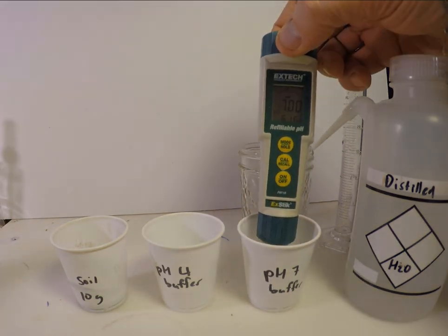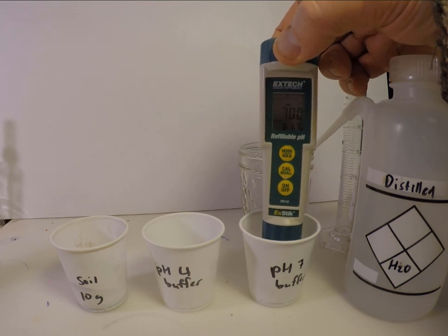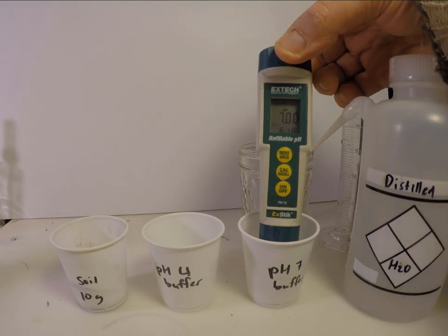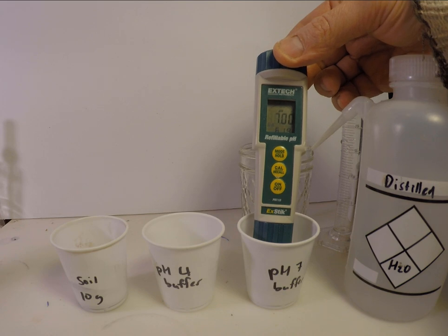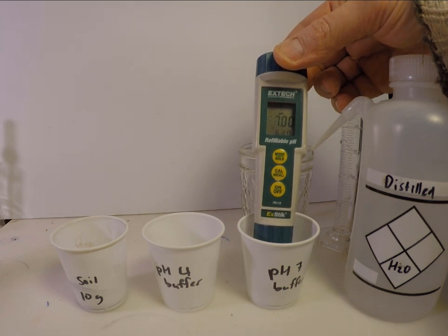Then the pH meter is immersed in the first buffer. For many pH meters, this is the pH7 or neutral buffer. When the reading stabilizes, it indicates this, here with the word end.